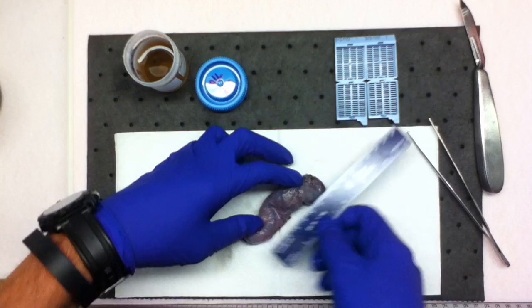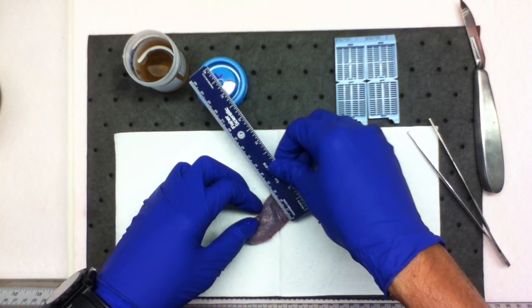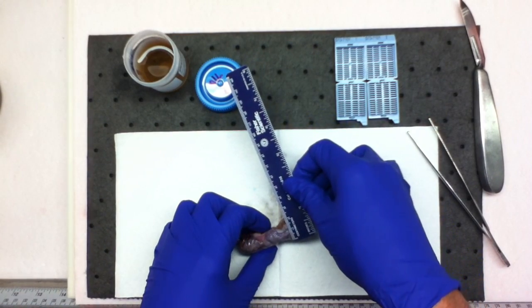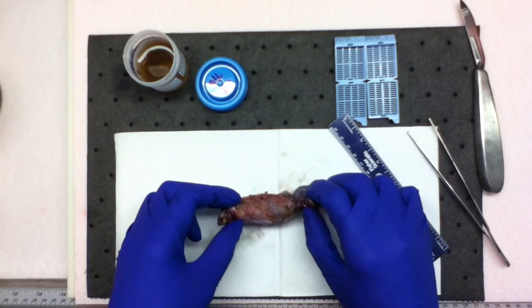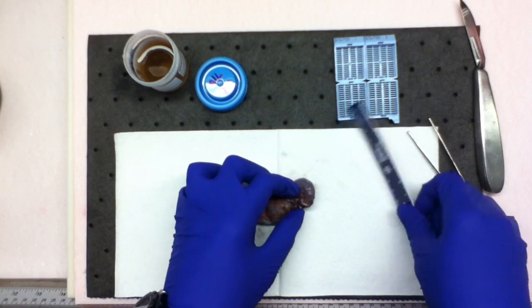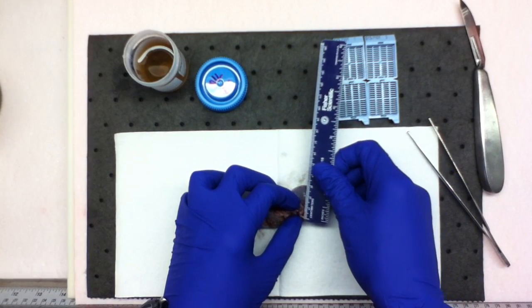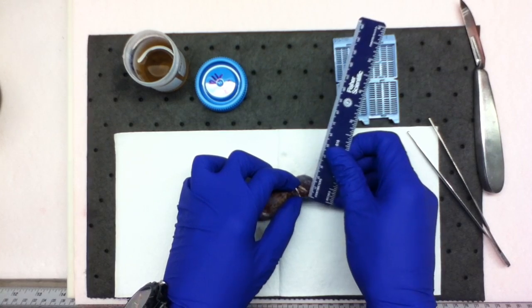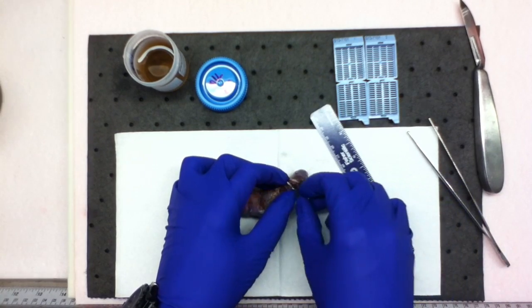It consists of a 9.2 x 3.1 x 2.2 cm intact gallbladder displaying a 0.4 x 0.4 x 0.2 cm attached clamp.